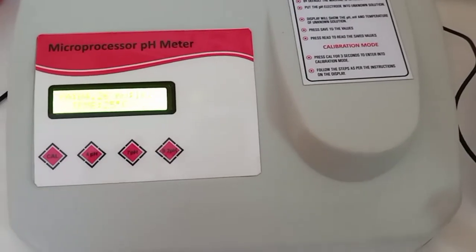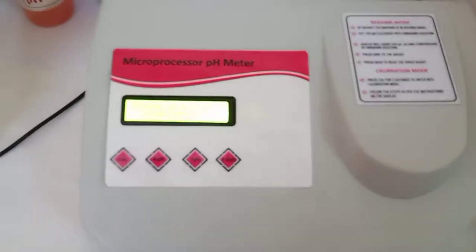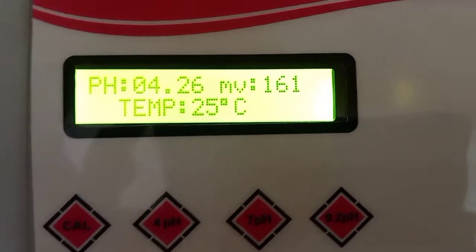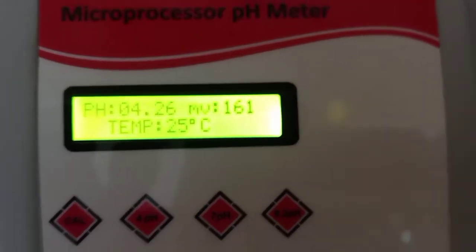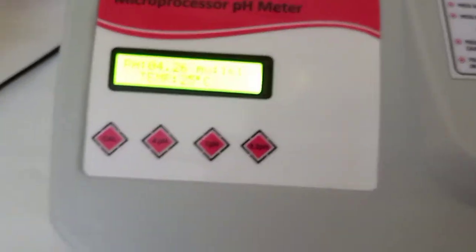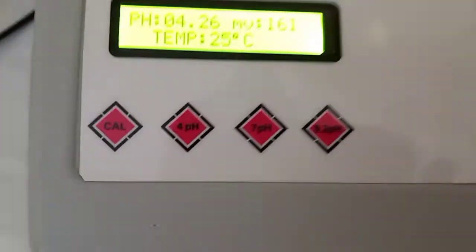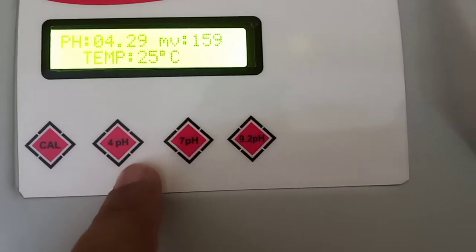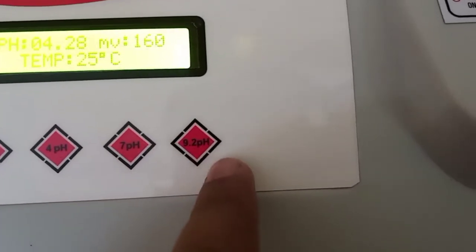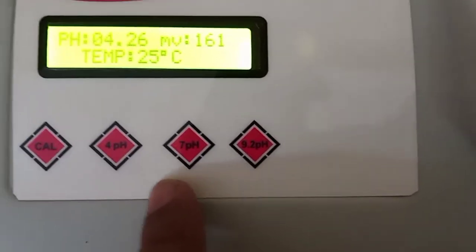This is a microprocessor-based pH meter with manual temperature display showing pH value, millivolt, and temperature set at 25 degrees in manual mode. This button is for calibration, and these three buttons are for 4 pH, 7 pH, and 9.2 pH — used during the calibration process.